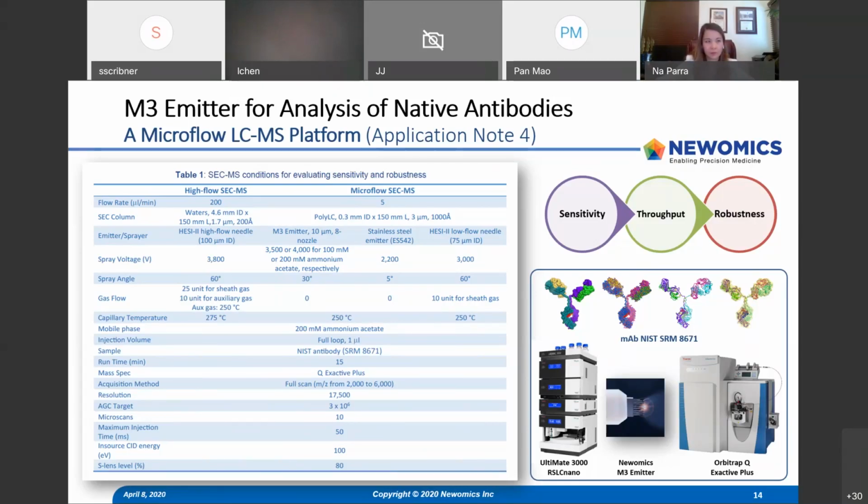For our QE Plus, I guess you mean cleaning the ion transfer tube, not the source. For the ion transfer tube, if we do native spray, we normally clean it about once in 2 weeks, also depending on how many samples you run consecutively without stopping.